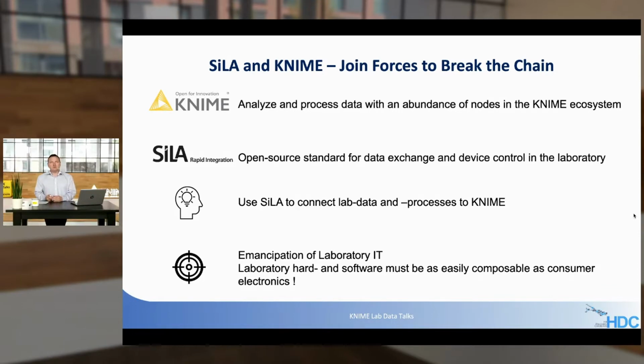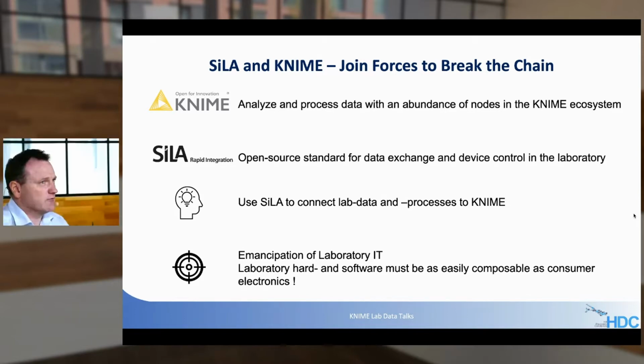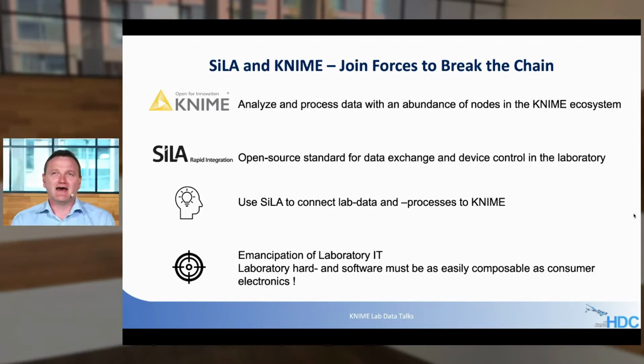The final goal for me is really the emancipation of laboratory IT. I think that laboratory IT should be as easily usable, measurable, and combinable as consumer electronics nowadays. If you use your PC, you plug in your headphones, your camera, you don't care if it's a Mac or a PC, it just works, most of the time at least. The final goal is to give the lab people the same freedom in designing their own system as you have in designing your own personal computer.